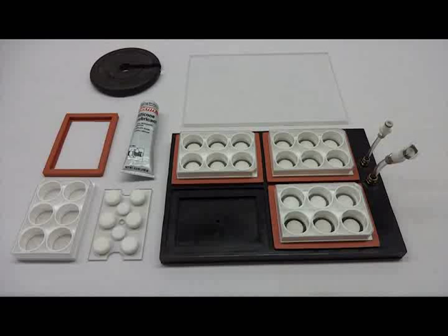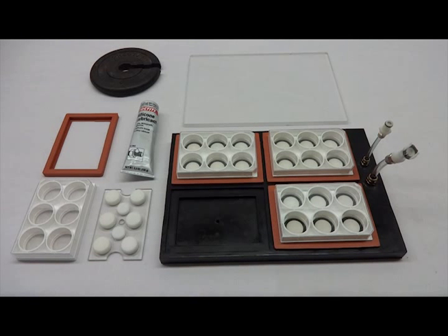To assemble your FlexCell Tension base plate for use with six well culture plates, you will need your black base plate with attached tubing, the four rubber gaskets, your four desired loading stations, four culture plates, silicone lubricant, and the clear acrylic window.